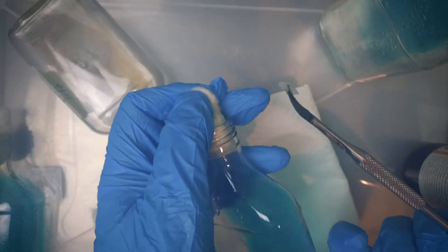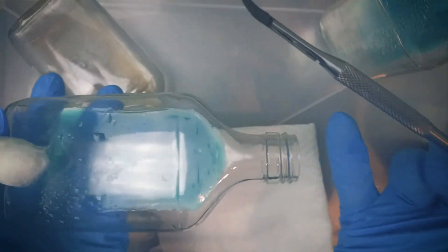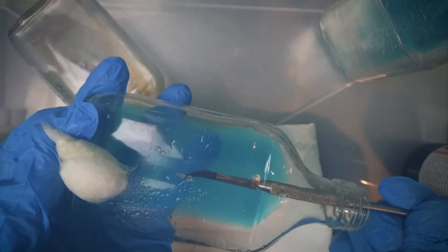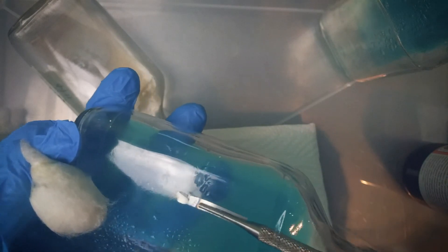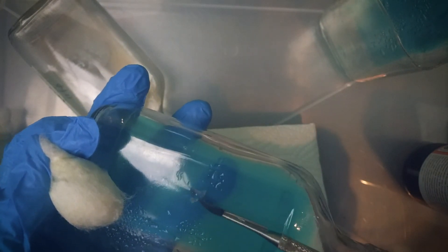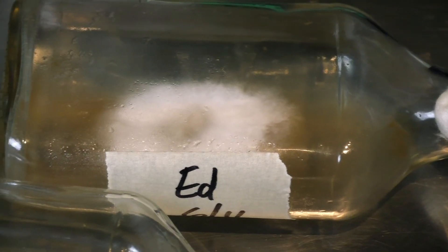I've had really good rates of success with this technique — it's very rare that I get any of these plates contaminated. I didn't have anywhere near the same rate when I was working with petri dishes. It's a pretty good technique: it's low tech, minimal waste, no single-use plastics, and a low rate of contamination. On the downside there's a bit more preparation and cleaning required, and you're limited slightly by the neck of the bottle in the accuracy of the work you do. Give it a try if you think it might be something for you. Feel free to comment with your thoughts on this technique — I'm learning lots all the time and I'd be happy to hear any feedback. Cheers.